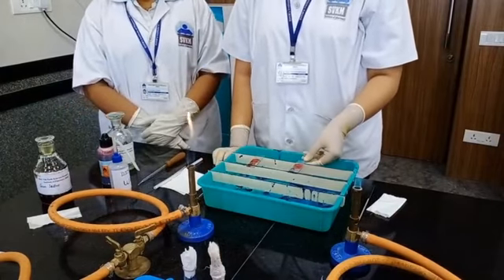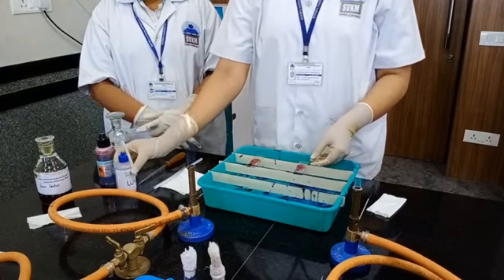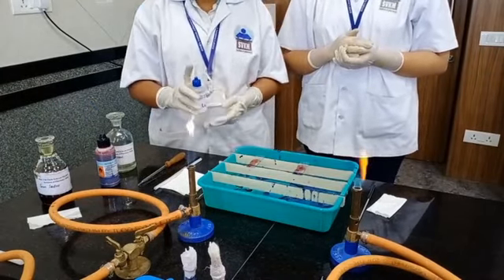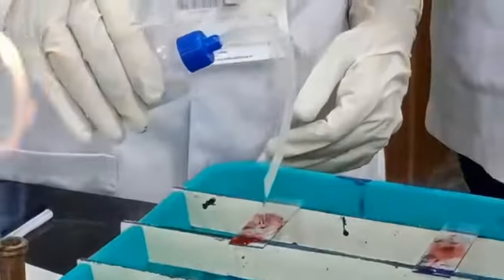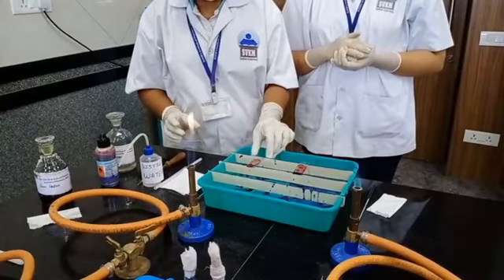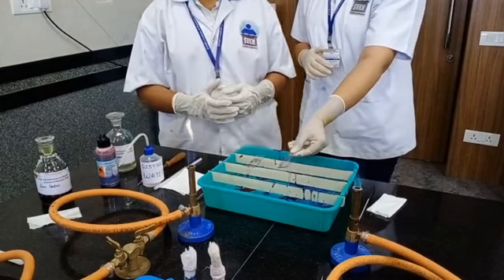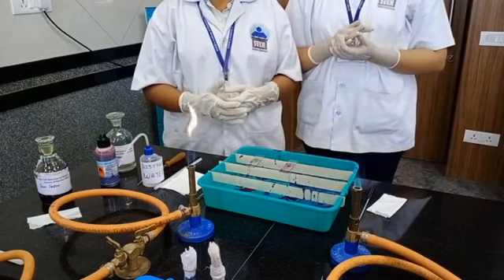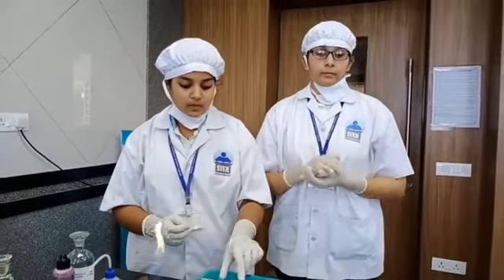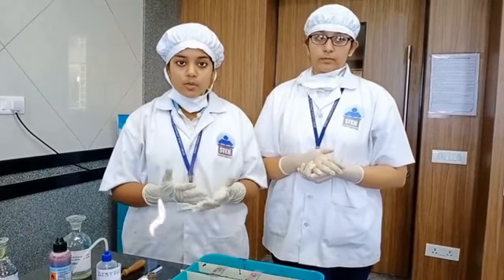Now safranin dye will be retained by gram negative bacteria. Now we will wash out the excess stain using distilled water. After washing off the excess stain, the slides are kept for air drying. Now after waiting 2 to 3 minutes of air drying, the results would be observed under the microscope.